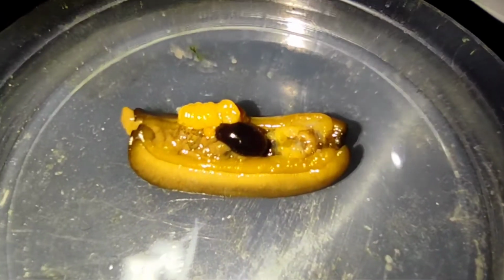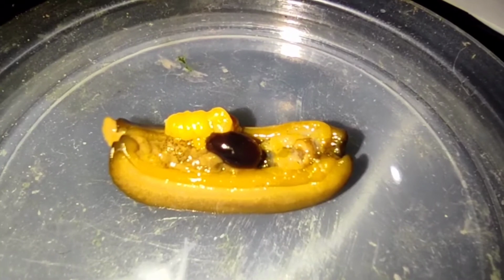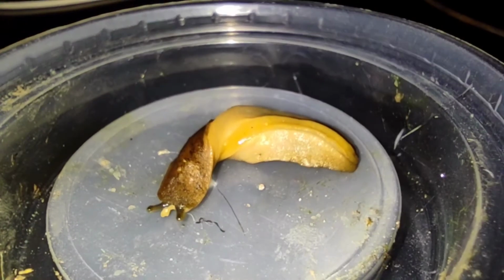Now that your slug is fully open, you can identify the internal structures as many as you can. So these are some of the internal organs of the slug that we have identified. So these are some facts about slugs.